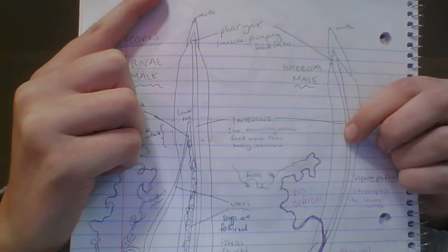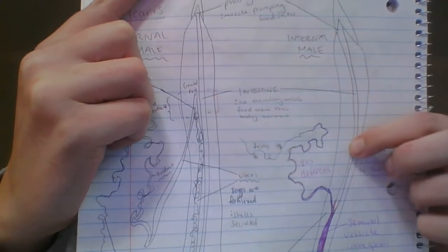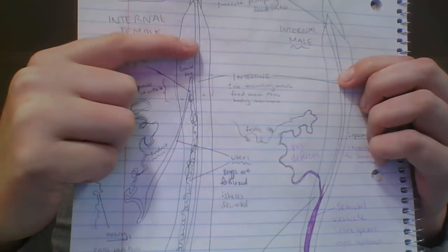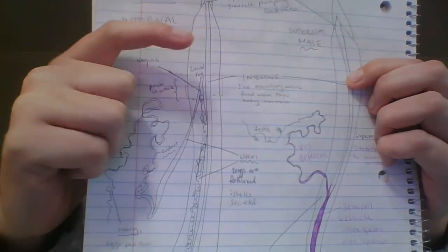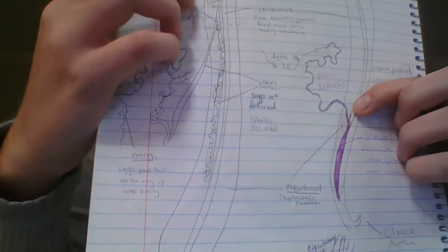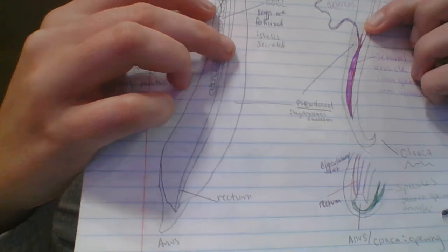The intestine moves the food through the body only when the body moves, like when the organism moves. It doesn't have any encircling muscles. But the intestine leads down into the rectum for both organisms, as we can see, both male and female.